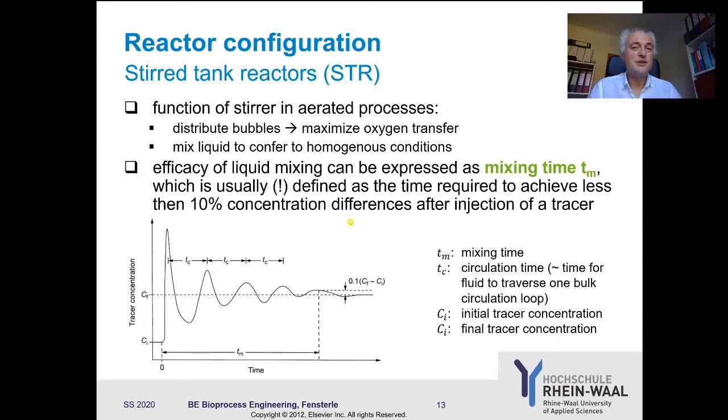You remember, as we talked about oxygen transfer, I always said that we neglected the mixing efficiency, because if we have optimal oxygen transfer, at least in smaller bioreactors, we also have high mixing efficiency. However, it's still important, because you remember what you do in a bioreactor. There is also a measurement and control unit. You had your own lecture in measurement and control engineering, or you're still doing it, I don't know, with my friend Platte.